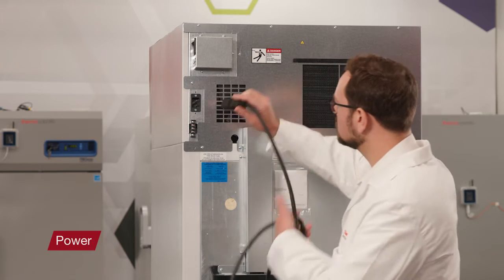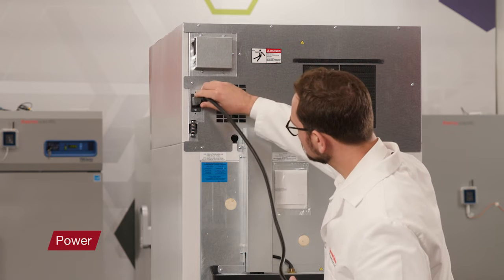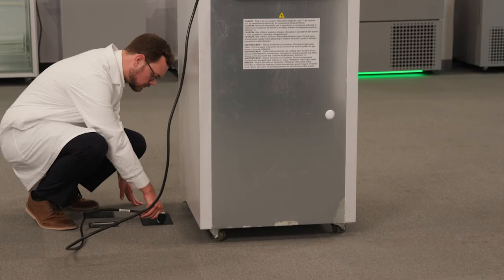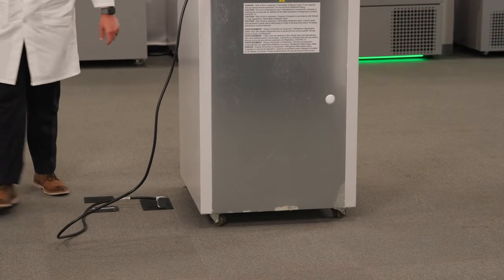Connect the AC main power cord to the main power inlet connector. Place the double-pull circuit breaker switch located next to the power inlet into the OFF position, designated by an open circle. Connect the AC main power cord to a dedicated circuit outlet.